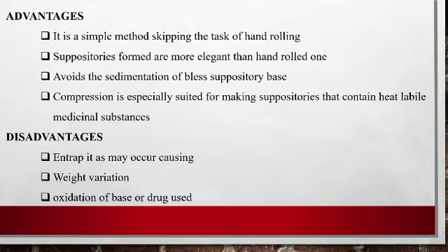The suppositories formed by this compression method are more elegant than hand rolled ones, and it avoids sedimentation of the bases. Compression is especially suitable for making suppositories that contain heat labile medicinal substances, which are easily formulated using this method.